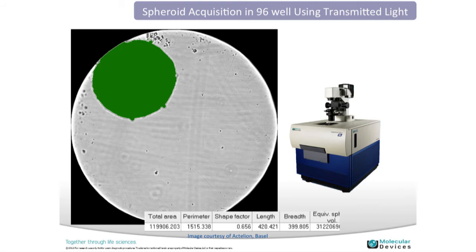A simple analysis that is frequently requested is monitoring spheroid size and area. This example uses white light with a non-labeled sample. Using the software coupled with the ImageExpress Micro, we're able to extract multiple parameters: total area, perimeter, length, and width, as well as various other parameters for the structure.